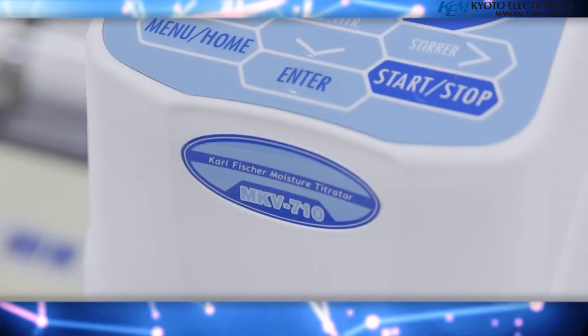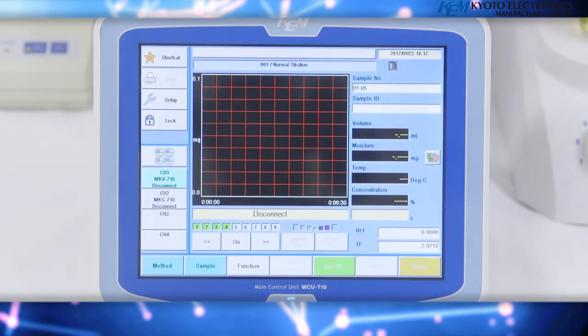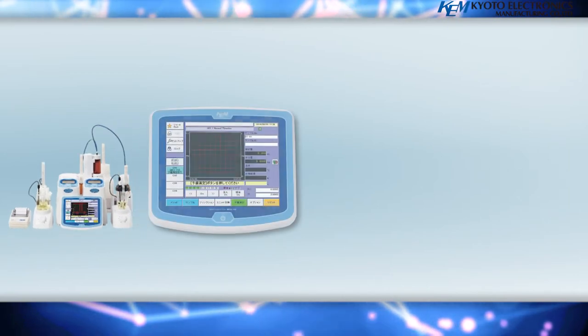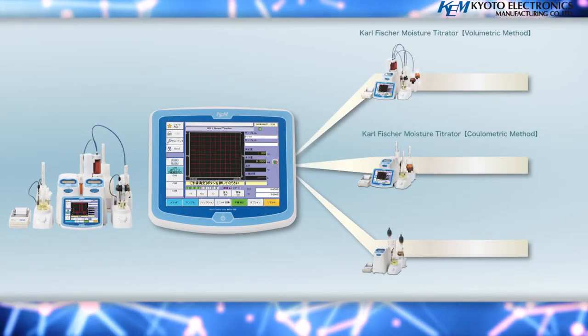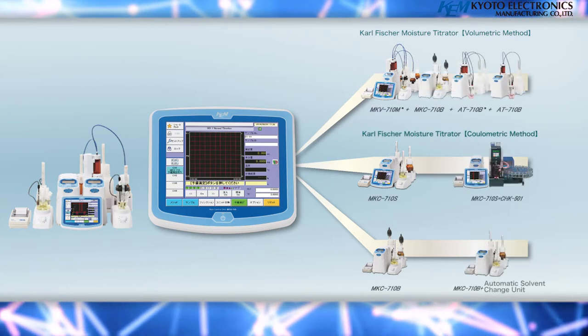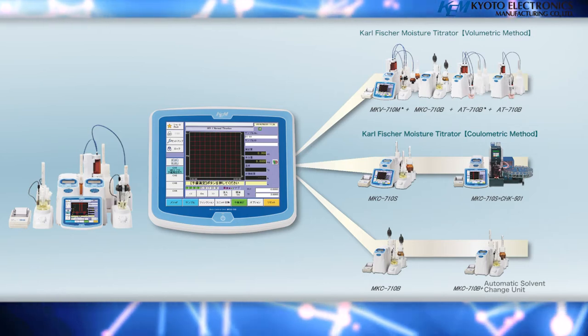With the ability to connect up to four measuring components, multiple measurements can be made simultaneously in parallel, which also allows for saving space. Not only MKV-710B volumetric titrators and the MKC-710B coulometric Carl Fisher titrators, but the AT-710B automatic potentiometric titrators can also be connected.